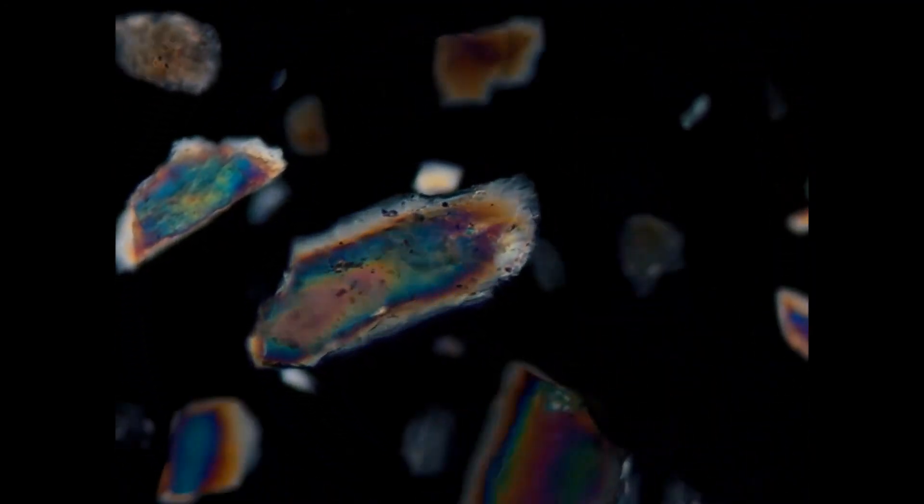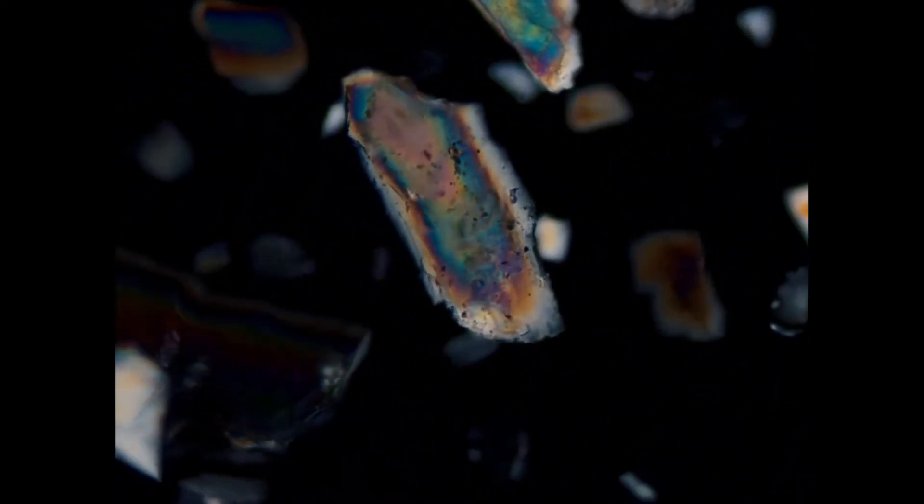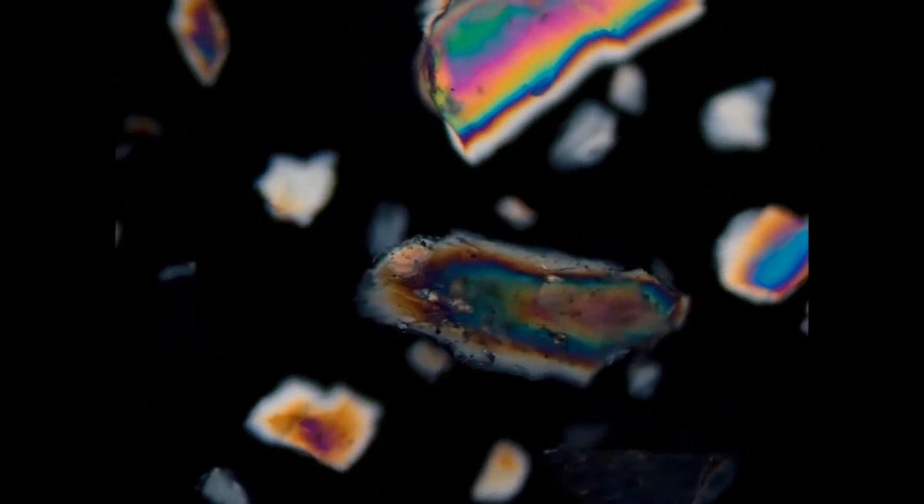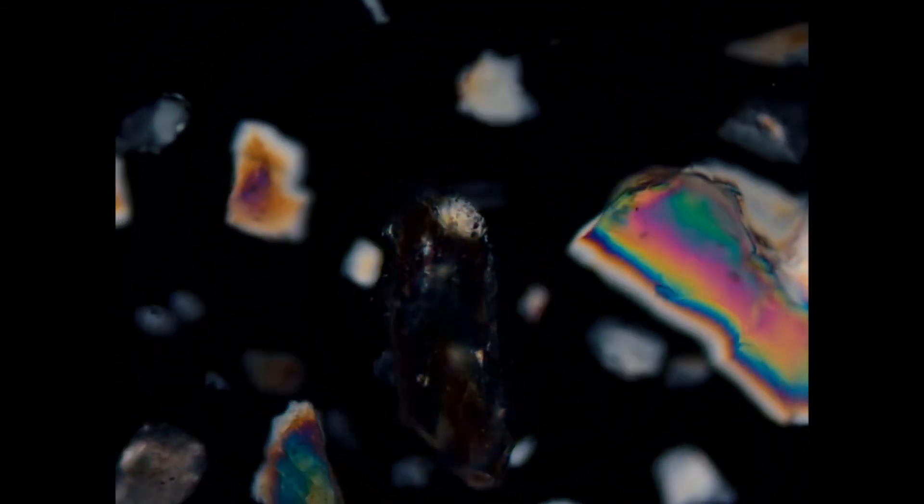If we rotate the grain under cross-polarized light, we can see that it is always extinct when it is oriented in a north-south direction, which means that it has parallel extinction.